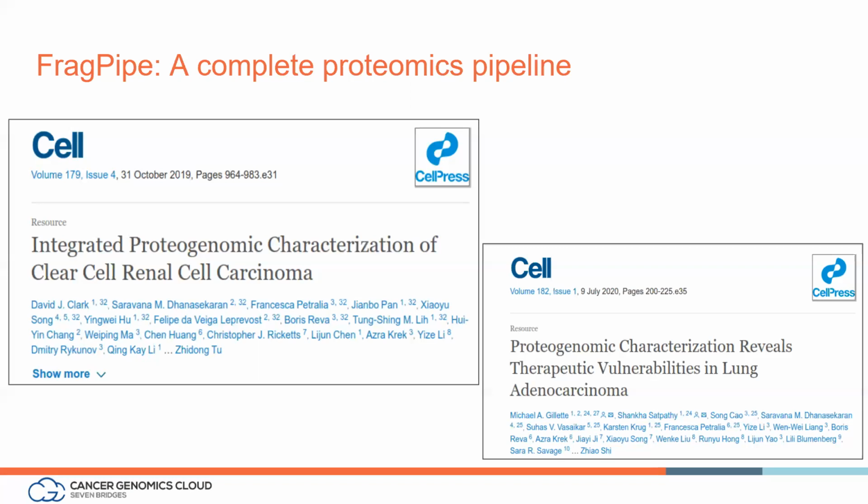More specifically, what we're going to show today is how to execute the pipeline in a way that you can reproduce the analysis that was done with the kidney data, the CCRCC data that was published a few months ago. You can go to the next slide, please.